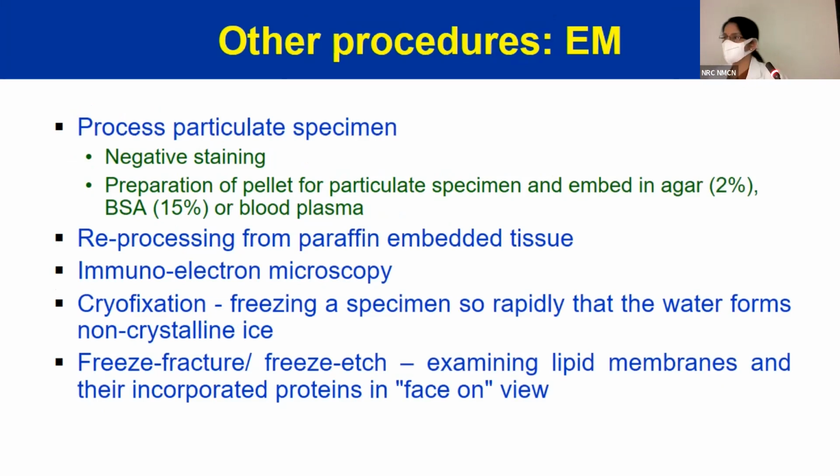So now, what are the other procedures an EM can do? Do we have somebody from microbiology? What is negative staining?